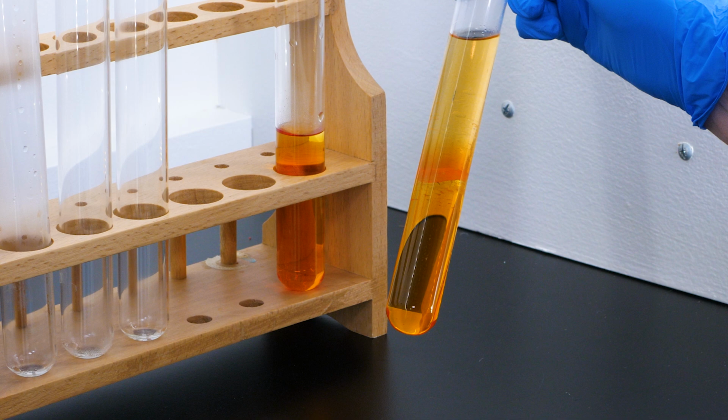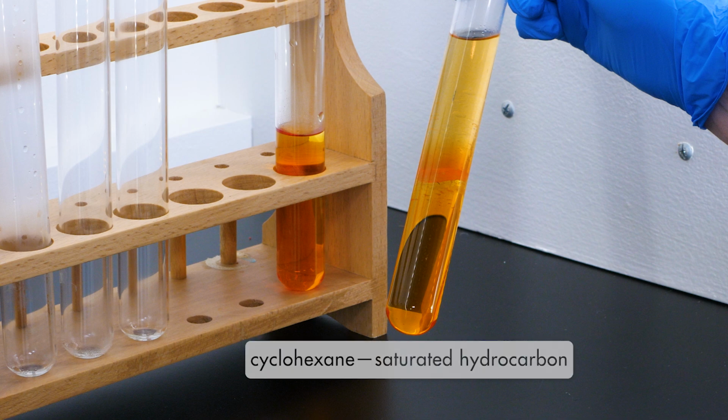Since no reaction occurred, we conclude that cyclohexane is a saturated hydrocarbon.